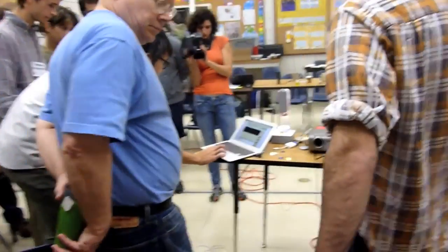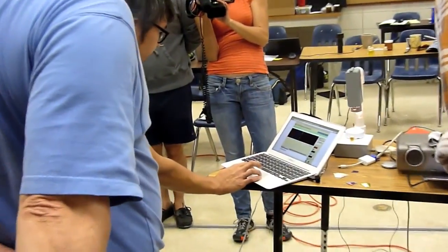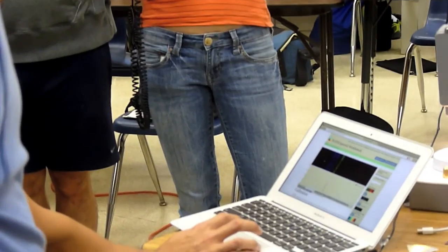So you can see it's like 25%, 27%. I'll click there. And it says, click on the bright green band. So I'll go over here. And we actually see 2. And I think that's a problem with how I built that. I think it's kind of a sloppy build. But I'm going to click right between them.